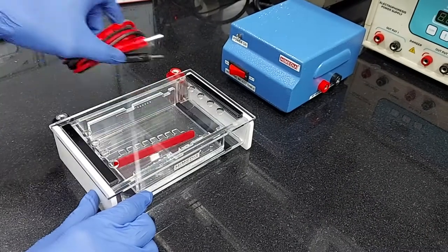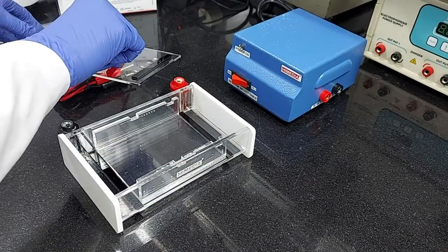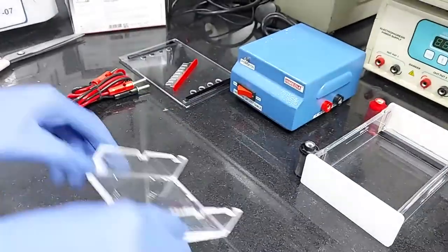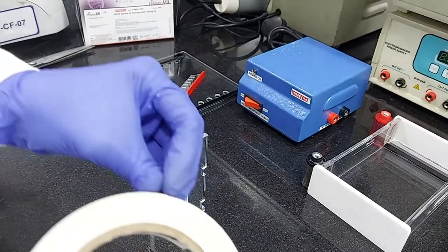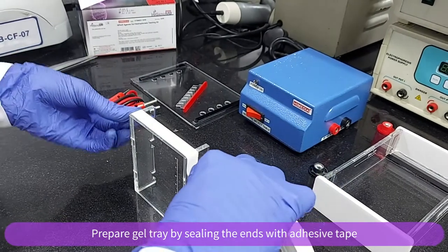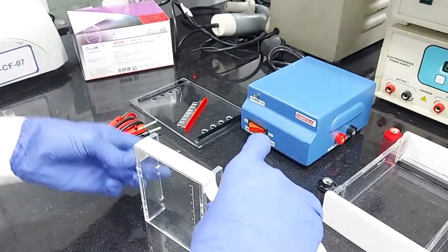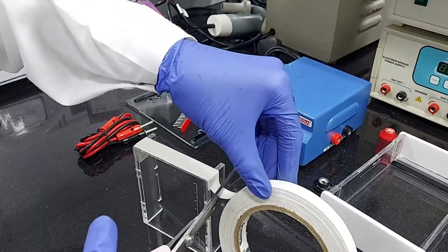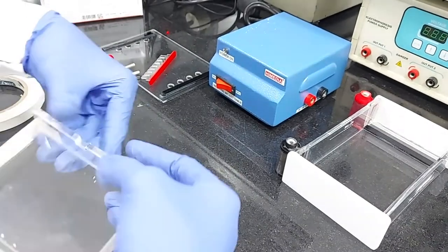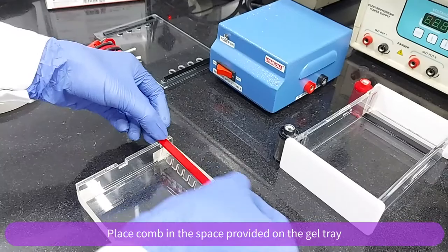Preparation of gel casting tray. Prepare gel tray by sealing the ends with adhesive tape. Place comb in the place provided on the gel tray.